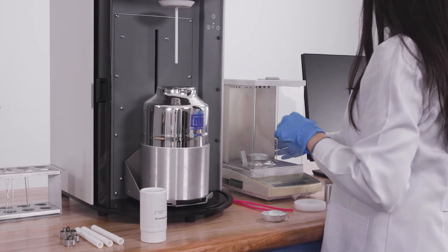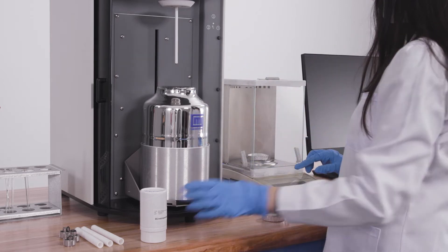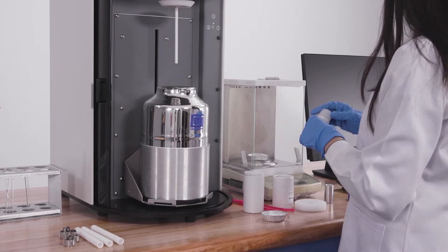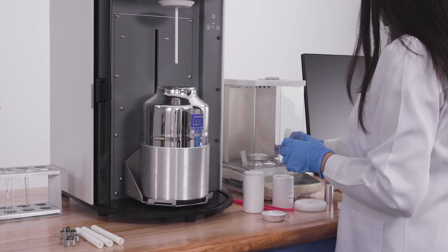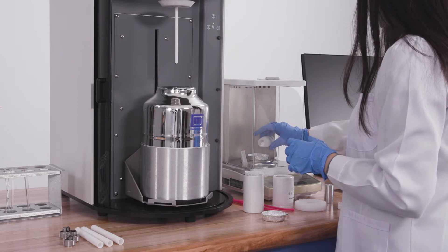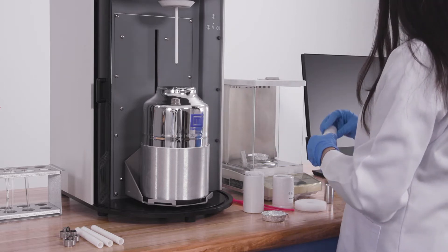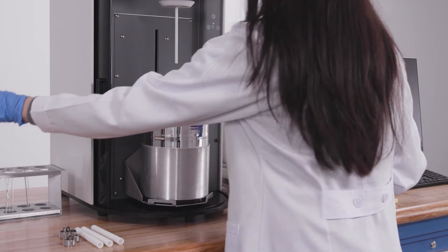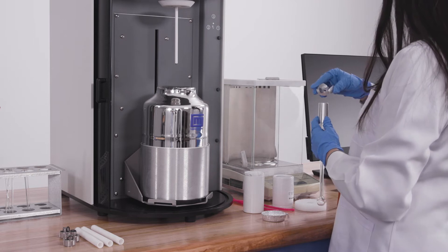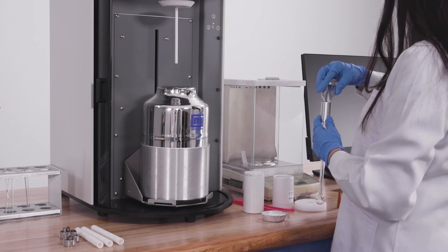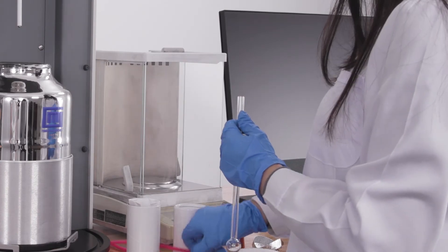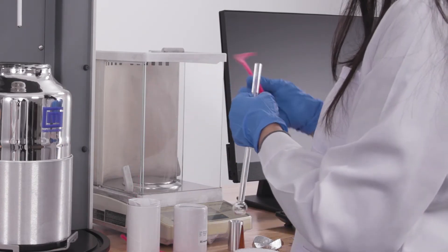Weigh between 0.2 and 0.3 grams on a weighing dish and transfer the sample into the sample tube using a funnel. Clean the walls of the sample tube with pipe cleaners as necessary.